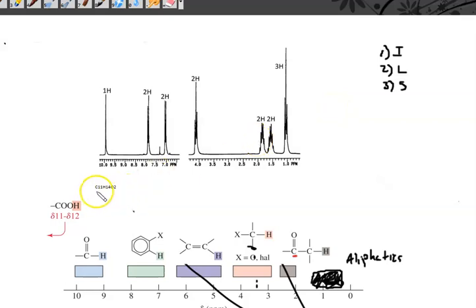The first thing is I have 11 carbons and 2 oxygens. Whenever I have a lot of carbons, I always look in this region right here first, because believe it or not, this tells me half of my molecule just like that. What peaks show up in this range? The aromatic ring.